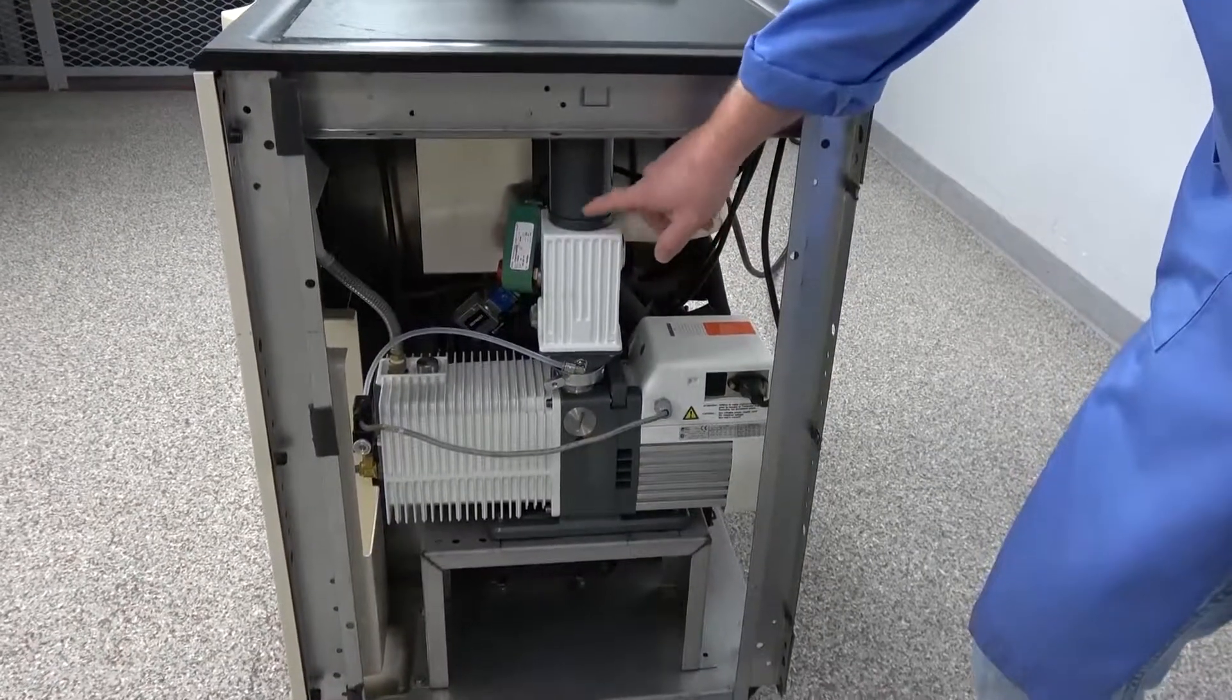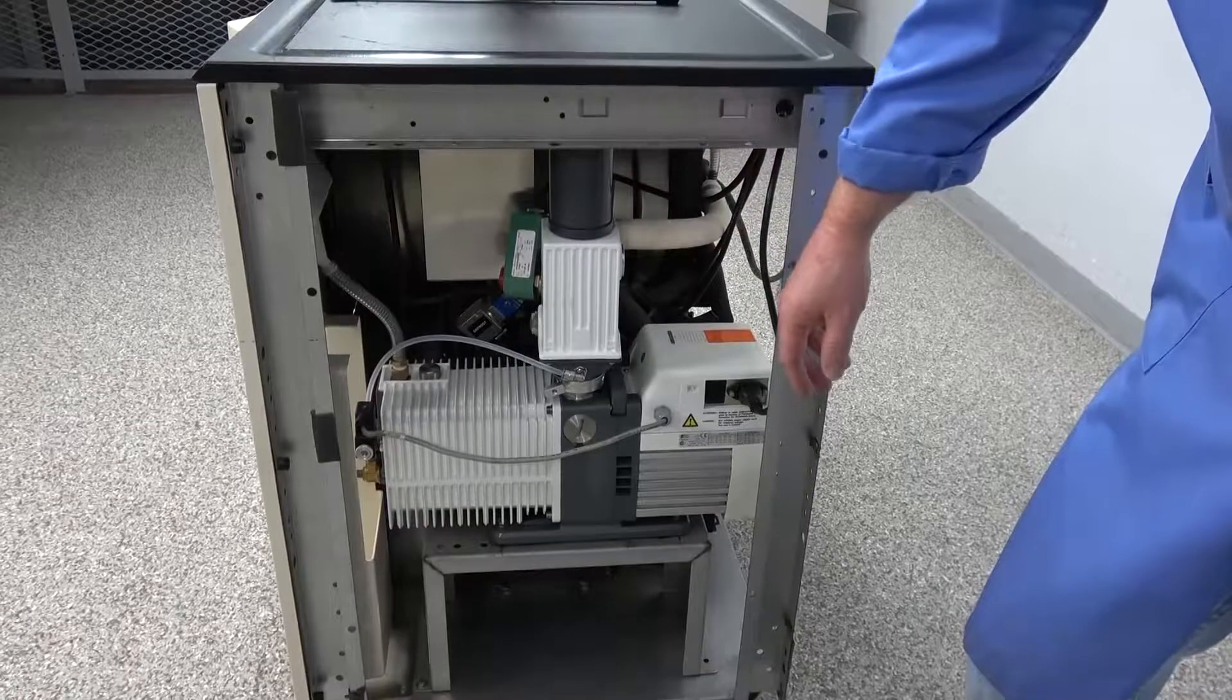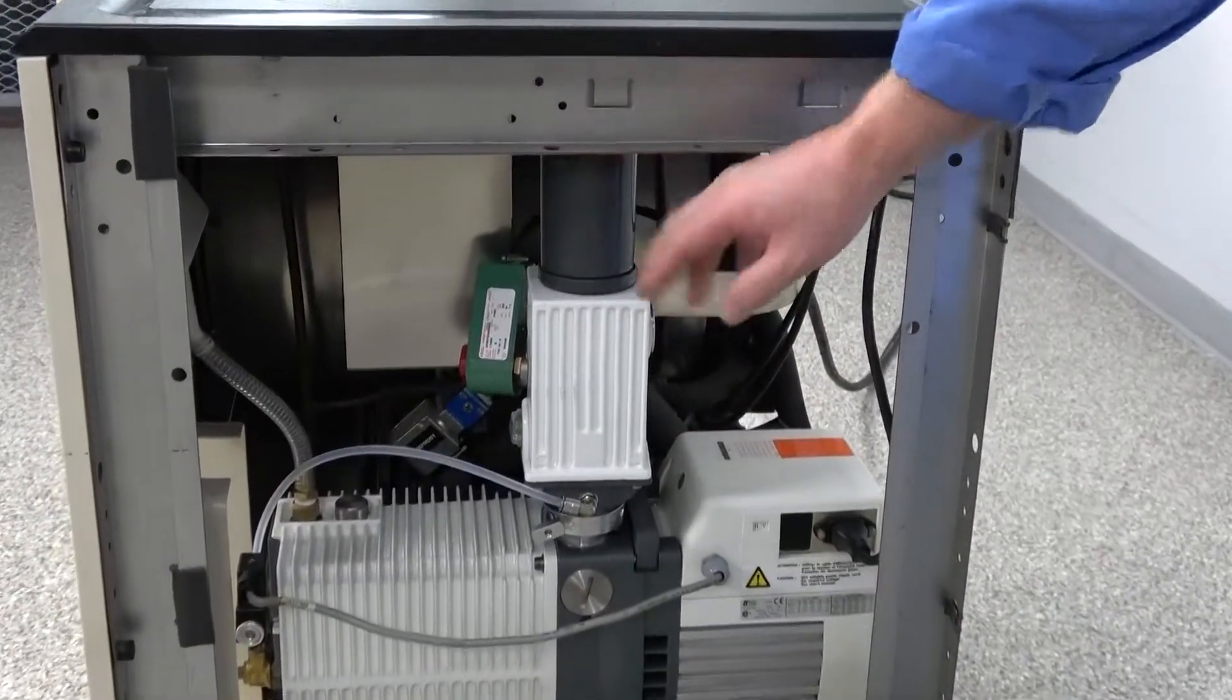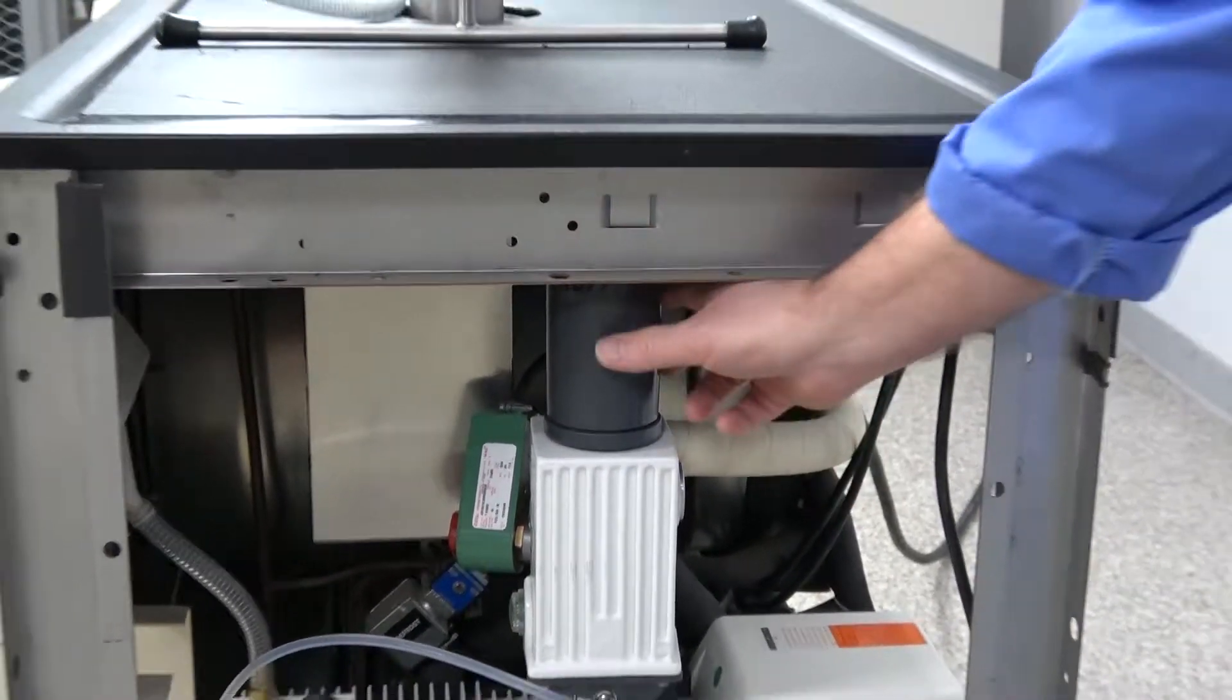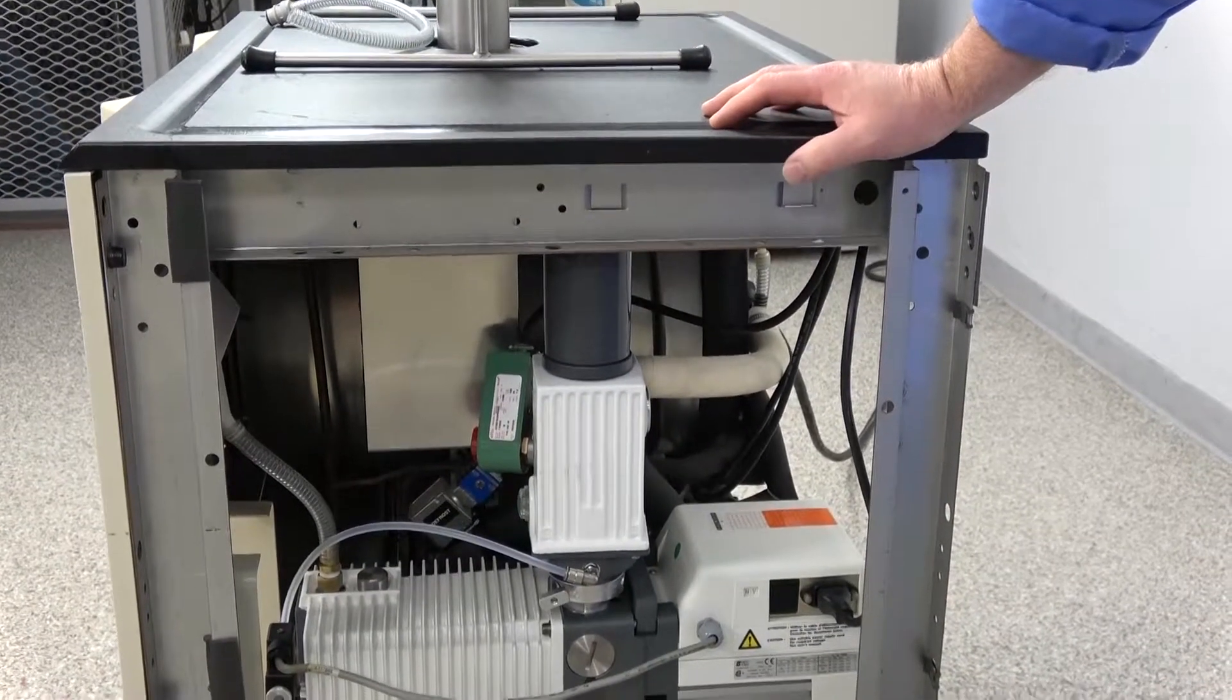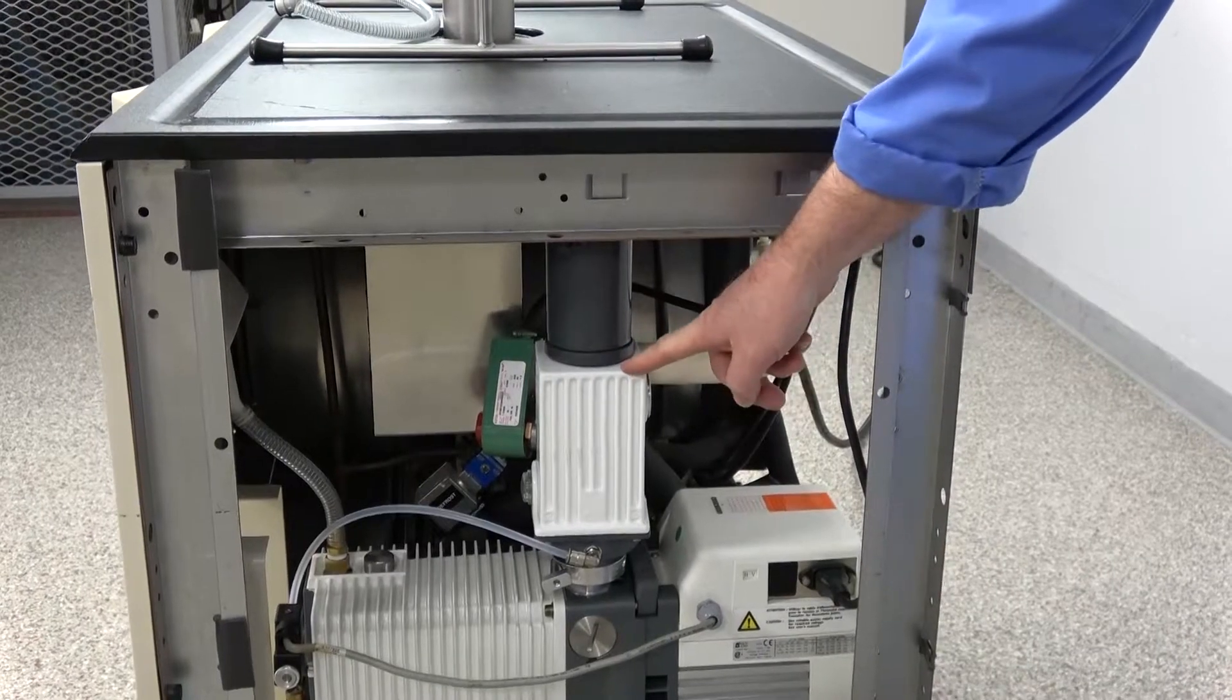And then the next thing I want to point out is what we add is a carbon filter. So this is actually a two-stage filtering system. You got your oil mist collector here and then also a carbon filter and it actually comes all the way up here. It's quite long so that you're filtering out any kind of fumes that might get into your lab. So that's something, again, that we've added.